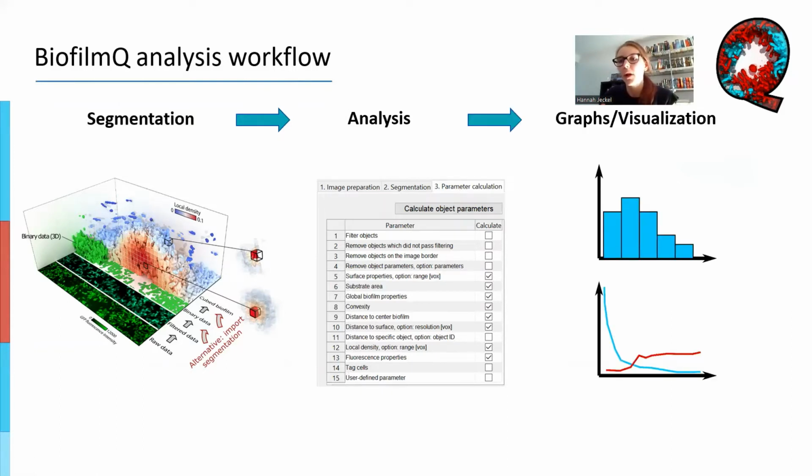And then finally, we also have a visualization tool directly integrated into BiofilmQ to enable you to look at your data and to see directly what happens. For example, if you make some changes to the settings here, how does it affect the outcome of the analysis? How sensitive is it? How can you optimize it, and so on? So all of this is integrated into BiofilmQ.